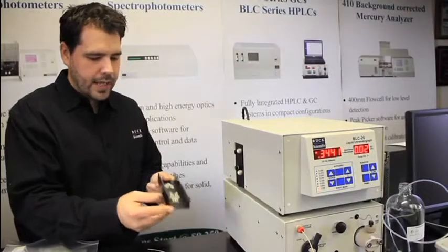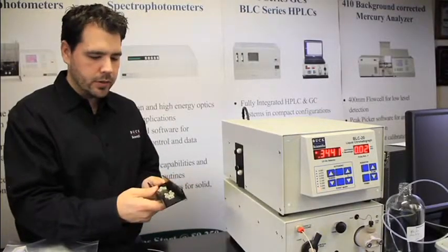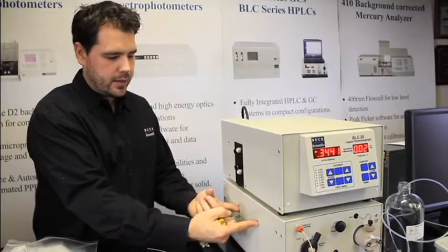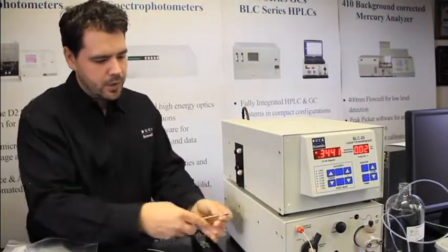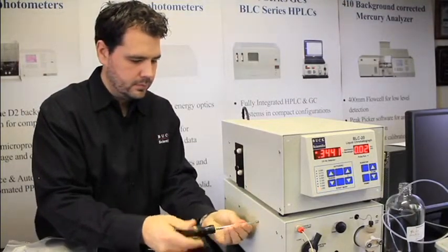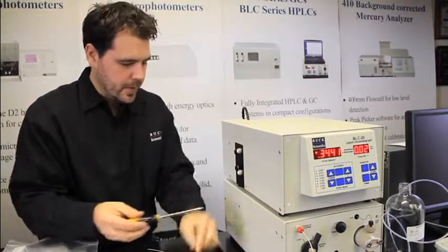We're going to attach the HPLC column holder next. There will be two screws on the side of the pump chassis. Remove the two screws with the Phillips head screwdriver and set them aside.